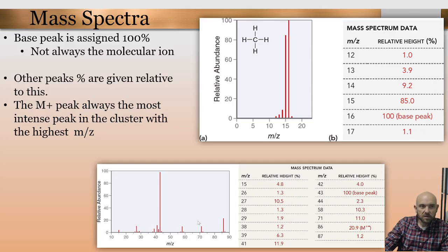So what that's saying is, if you look furthest down the mass part of the spectra that a mass spectrometer returns, then the molecular ion peak is going to be the one. You find the last group on the end here, and the molecular ion peak is going to be the most intense peak, or the peak with the highest abundance, the highest percentage in that group.